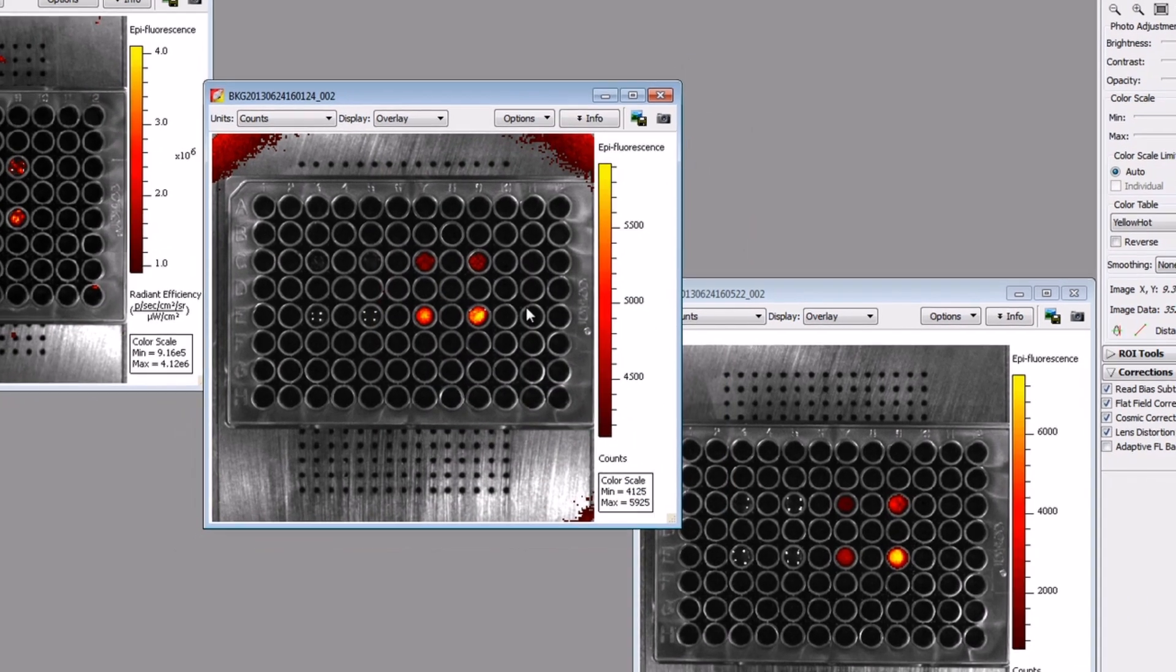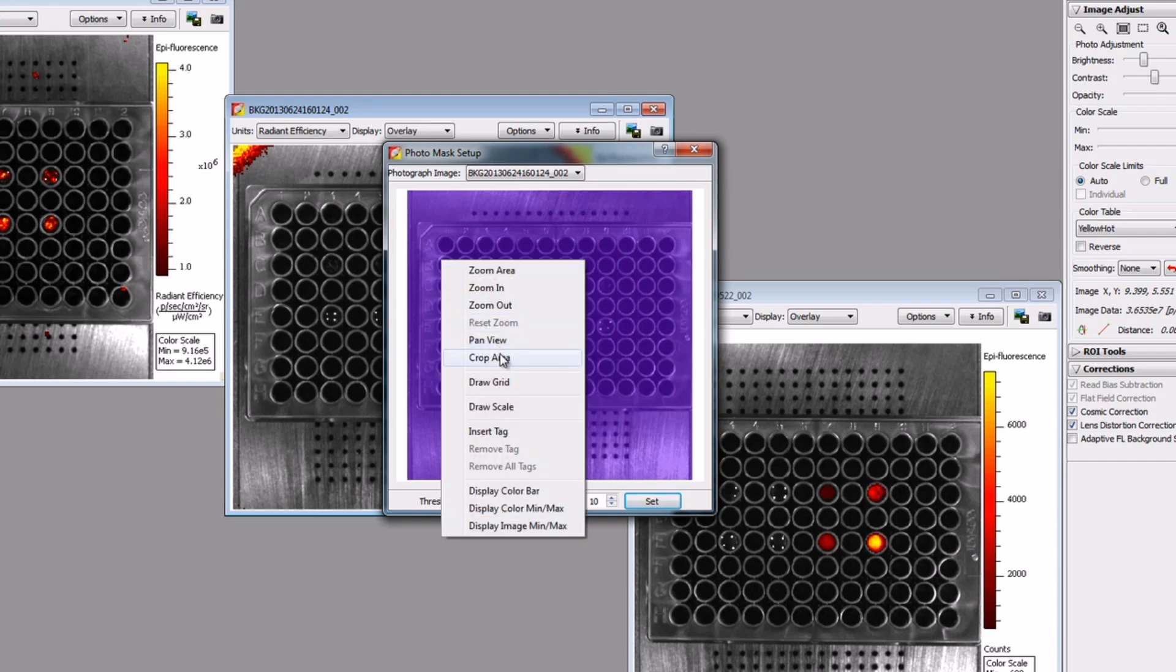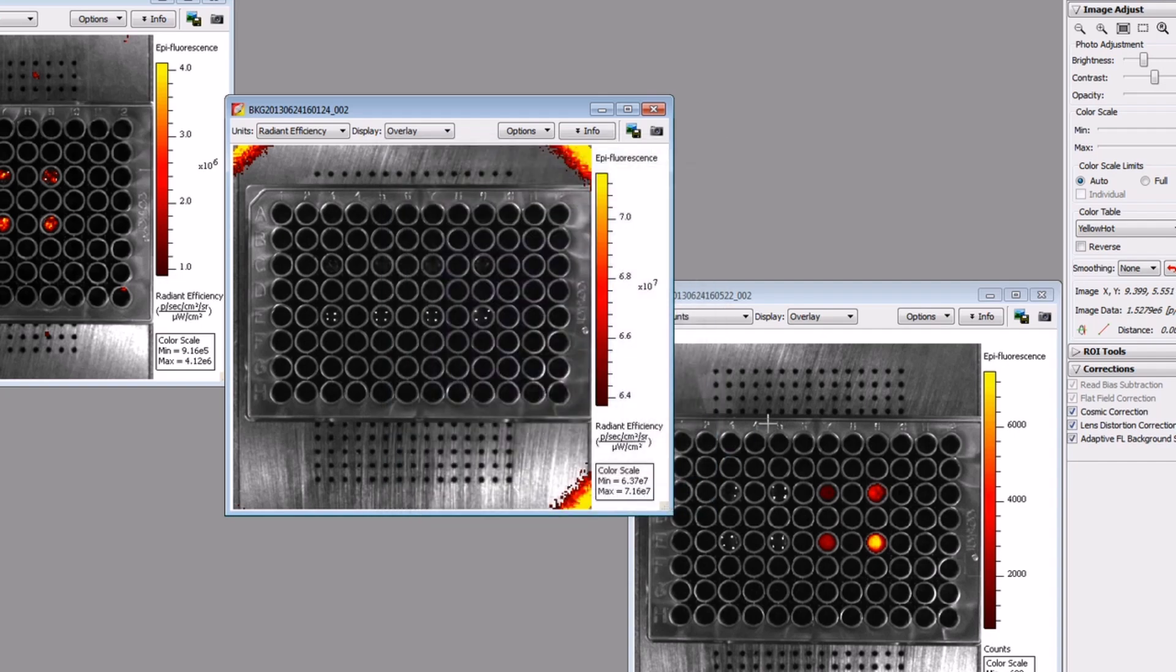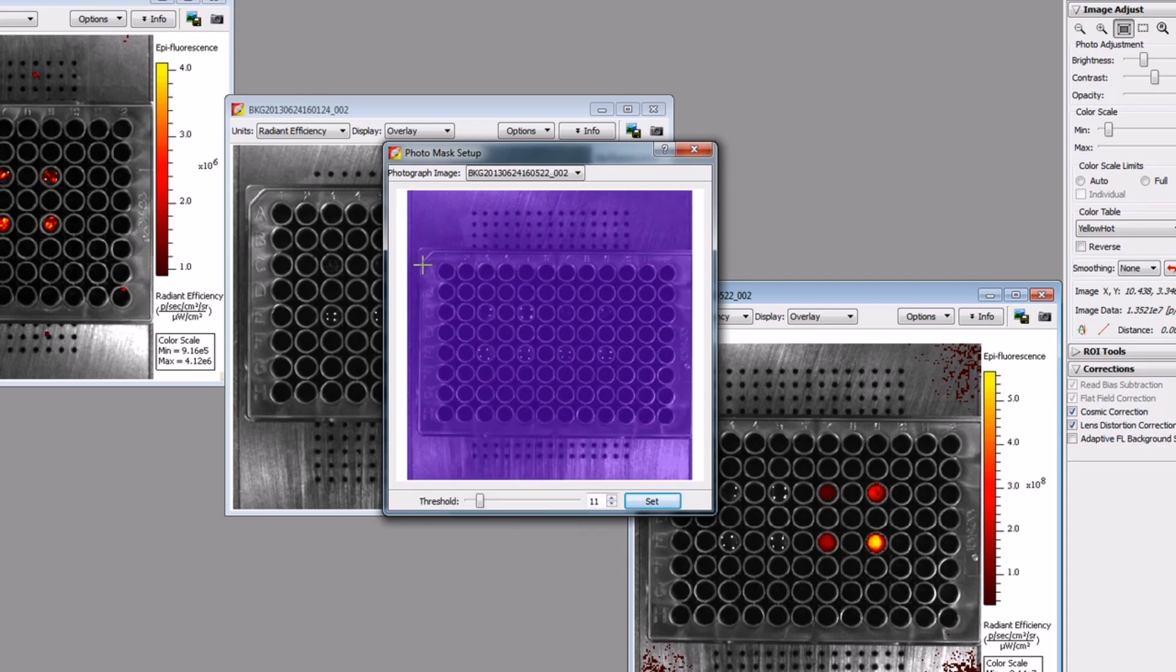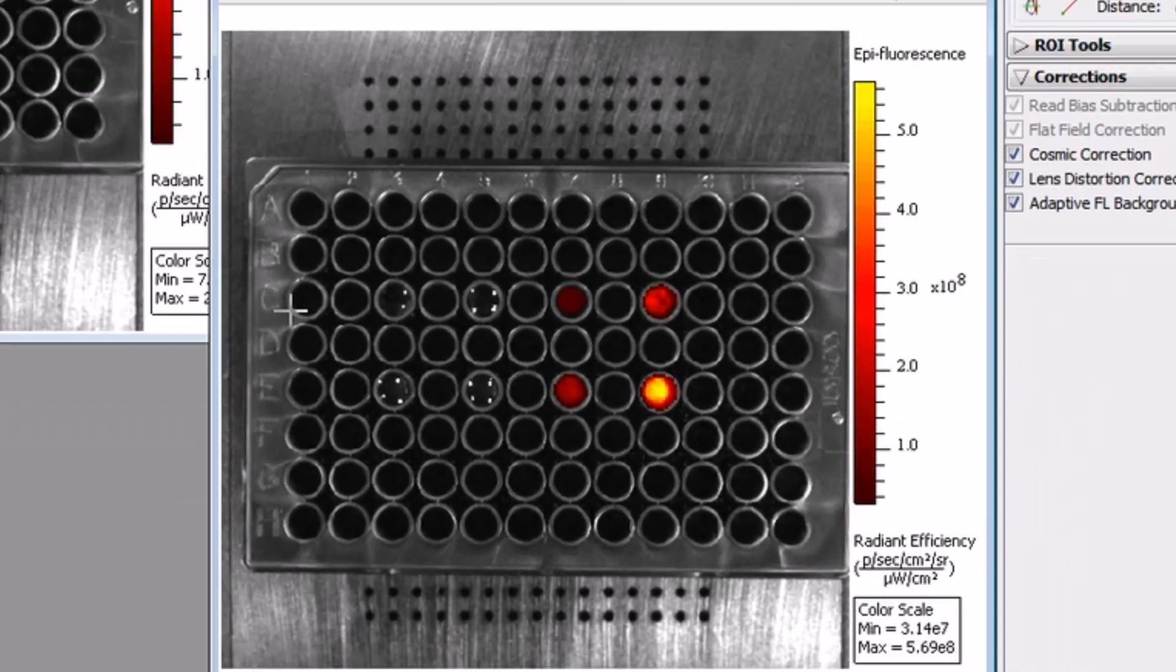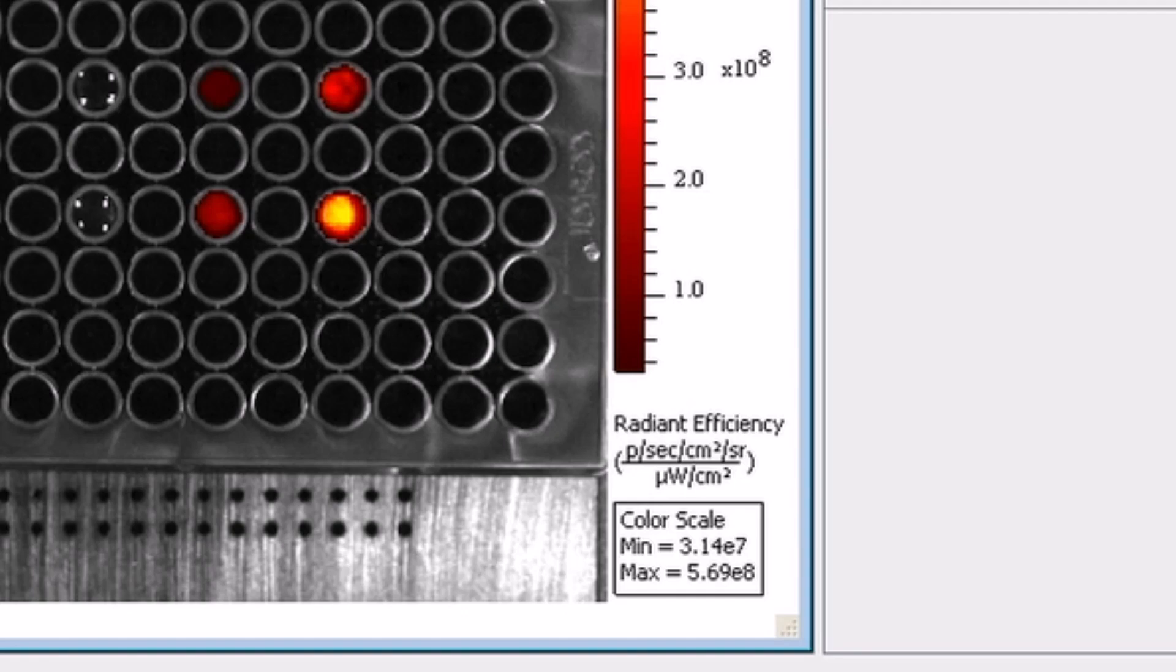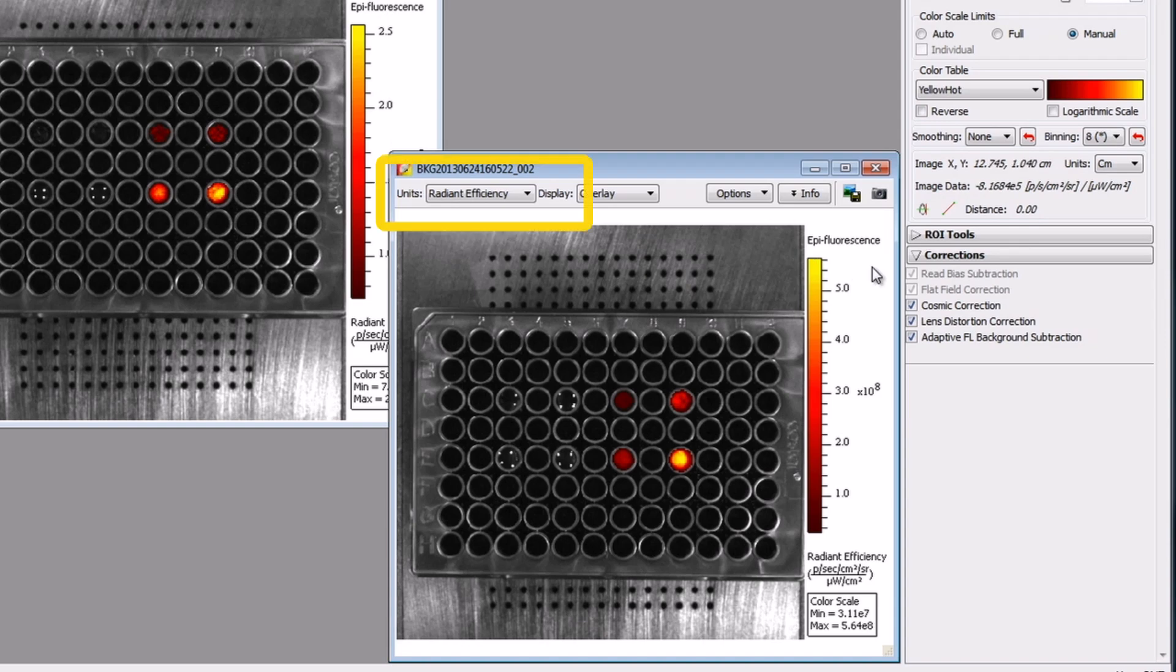To get quantitative results from your fluorescently labeled cells, switch from the raw data unit of counts to the calibrated unit. With bioluminescence, you may recall that the calibrated unit is radiance or photons. However, with fluorescence, we must account for the excitation light projection on the stage and the non-uniformity of that light projection. We can do this by normalizing for excitation light intensity per square area of the field of view. Therefore, the calibrated unit for epi-illumination fluorescence is termed radiant efficiency: photons per second per centimeter squared per steradian divided by microwatts per centimeter squared. You can easily select this unit from the units pull-down menu in the upper left-hand corner of the image window.